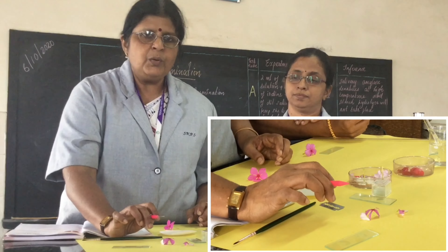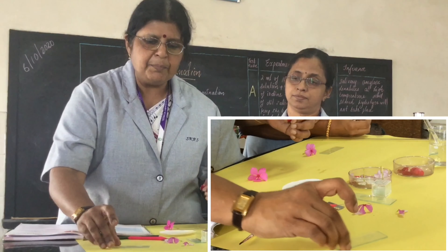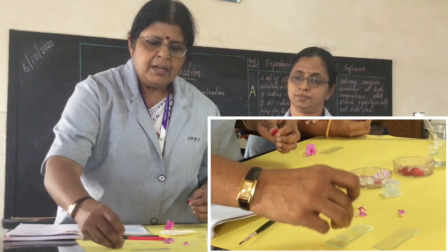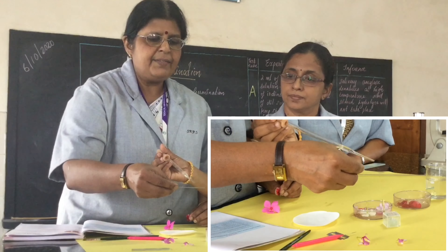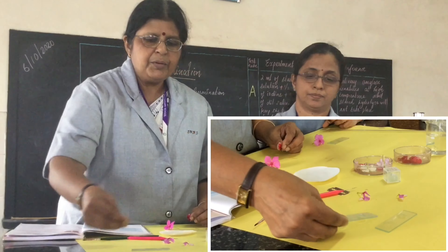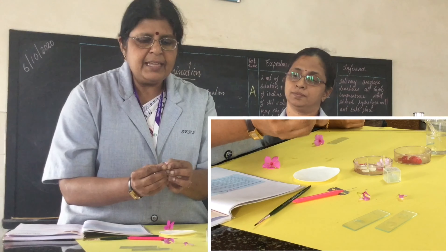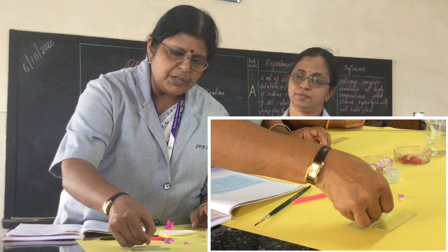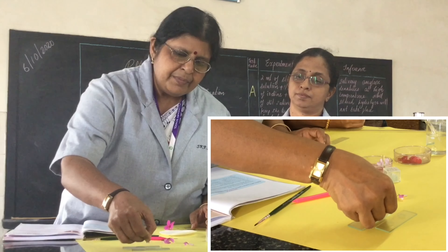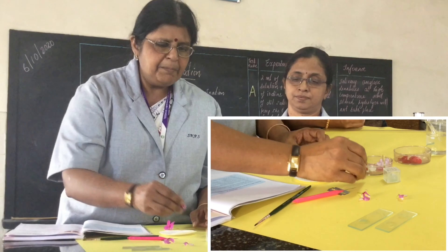Now if you are using balsam, it is much more simple. Take a cavity slide again and put a drop of nutrient medium into the cavities. In balsam, the anthers are exposed, so just simply dust or press on it and the pollen grains will come onto the nutrient medium.